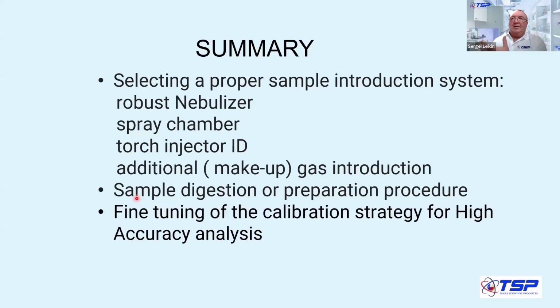Then, if you run high accuracy analysis, look at your calibration data. Your residual error or relative error in percentage, depending on the terminology used by your ICP manufacturer, you have to play with the statistical weight to bring your residual or relative percent error to better than 0.5% at least if you're looking for 2% relative accuracy.